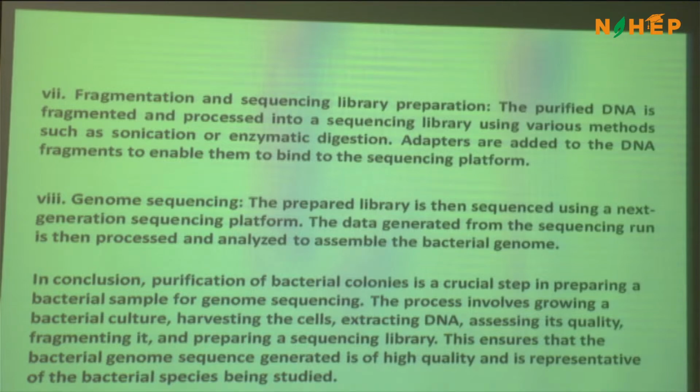You may wonder how to handle a metagenome sample, right? Metagenome sample is no different from that. The only difference here is you are not going to subject the sample to culturing technique, rather you are going to directly extract the bacterial community from the environment. Okay, how is it done?